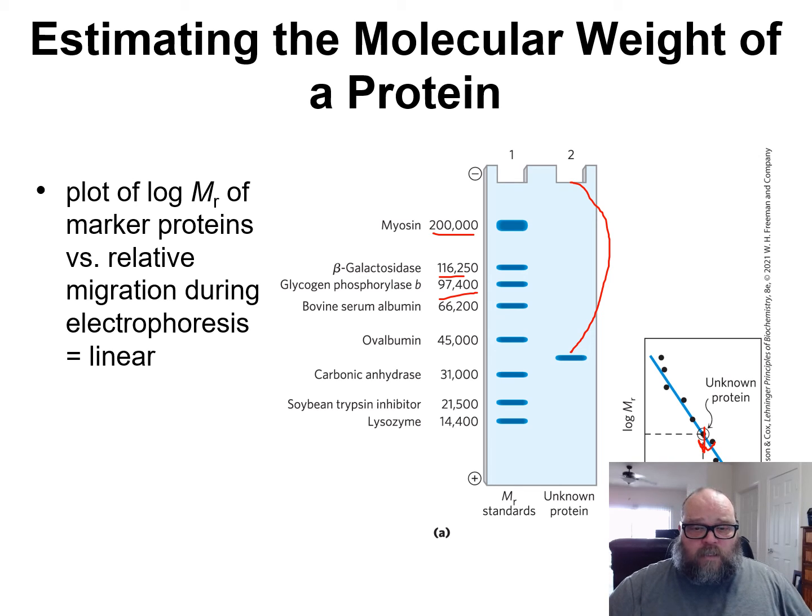And a lot of times students want to sit there and look and just say, hey, look, here's the protein. I'm just going to go over here. It's between 45 and 31, about halfway through. So that's 9, that's 14. So I'm going to split it in half, and there you go. No, you can't do that. That's if everything is working linearly. Though here everything's moving logarithmically. It's not linear. This distance is not the same between this and this and this.